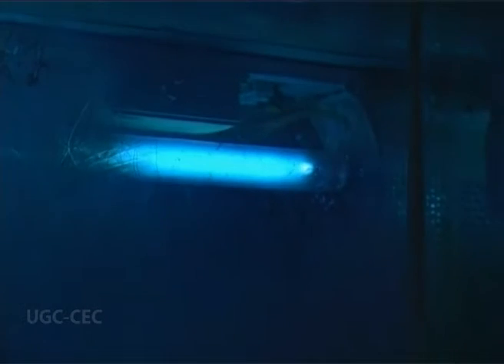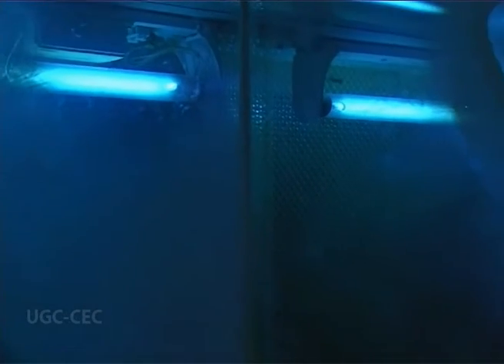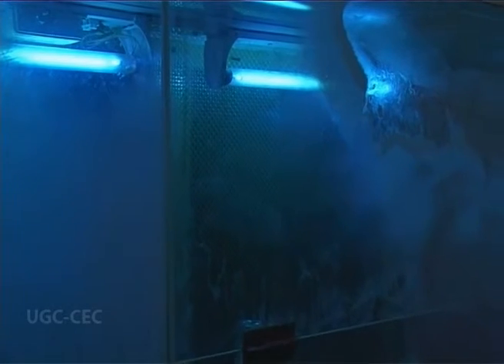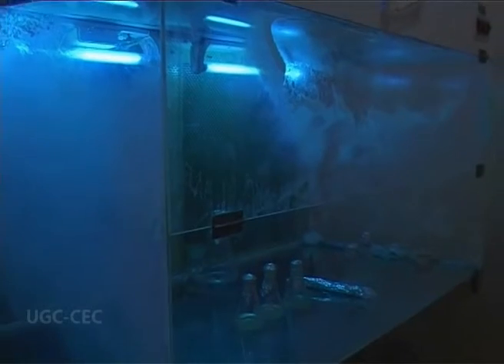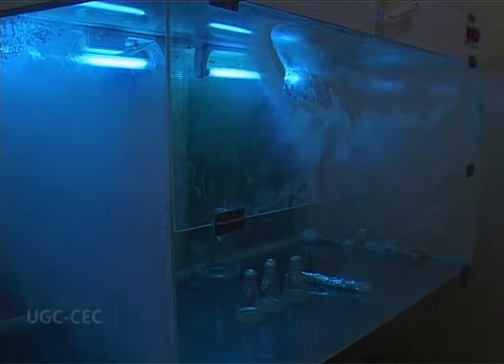The velocity of air coming from the filters is about 27 plus or minus 3 meters per minute, which is sufficient to prevent the contamination of the working area by the worker sitting in front of it. Laminar airflow has a UV lamp that is turned on about 10 to 20 minutes before being used for inoculation to sterilize the surface of the laminar airflow.